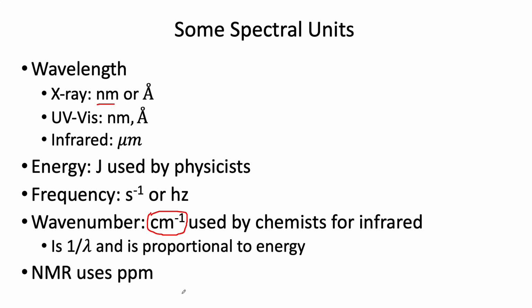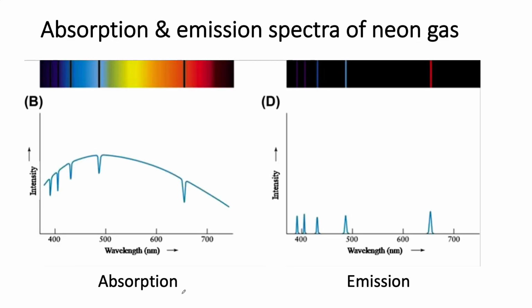Okay, so now let's take a look at some atomic spectra, which spectra, of course, is the plural of spectrum, one spectrum, two spectra. All right, so this is an absorption spectrum here. This is just intensity. It's not normalized. So your light source, in this case, had some of this general shape here. It had a little more light in the middle than it did at the side. So this part of it's coming just from the light source.